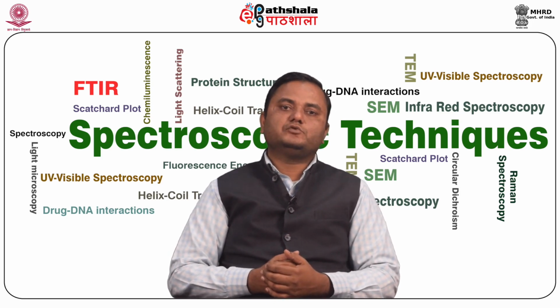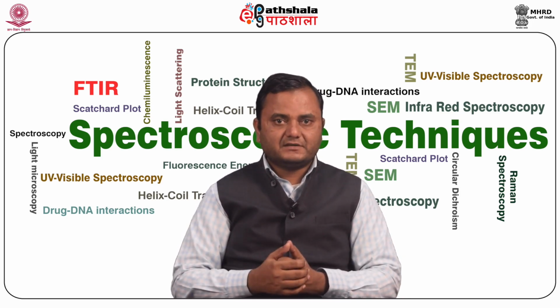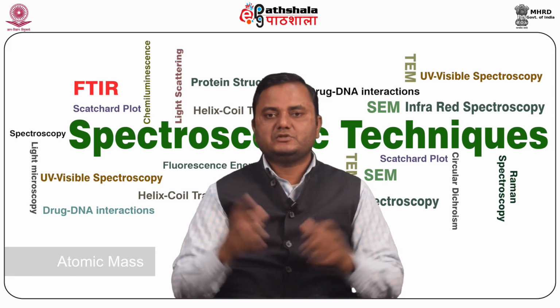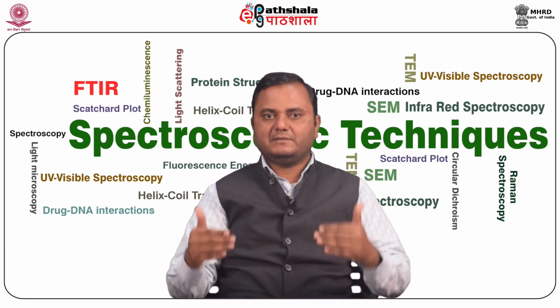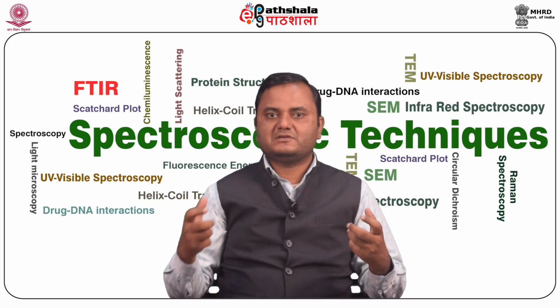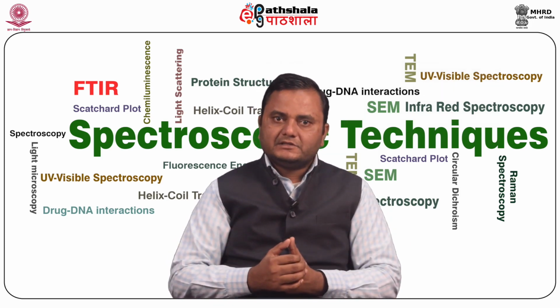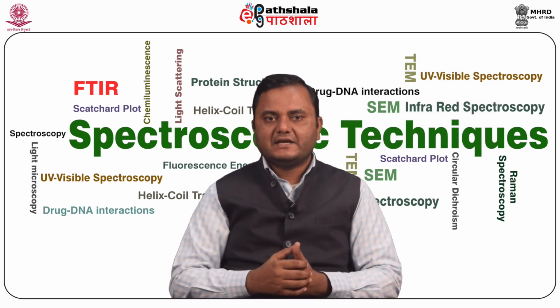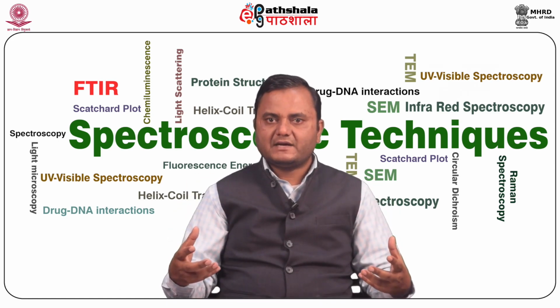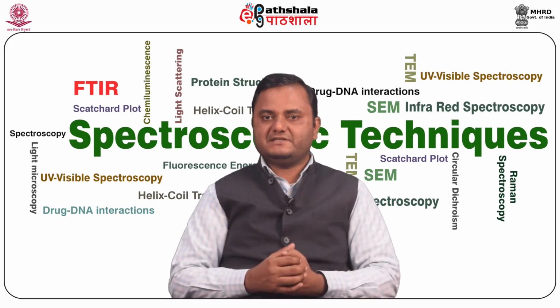Now we talk about the key functional groups by region of the IR spectrum. Two factors influence the energy, and thus the wave number, at which a bond absorbs: the bond strength and the atomic masses. The type of bond, double, single or triple, decides the strength of the bond, and atomic masses determine the vibrational state of the molecule, like a spring. The stronger the bond, the higher the frequency of vibration, and similarly the lighter atom vibrates at higher frequency. So atoms with low mass have very high frequency, whereas atoms with higher masses have low frequency.